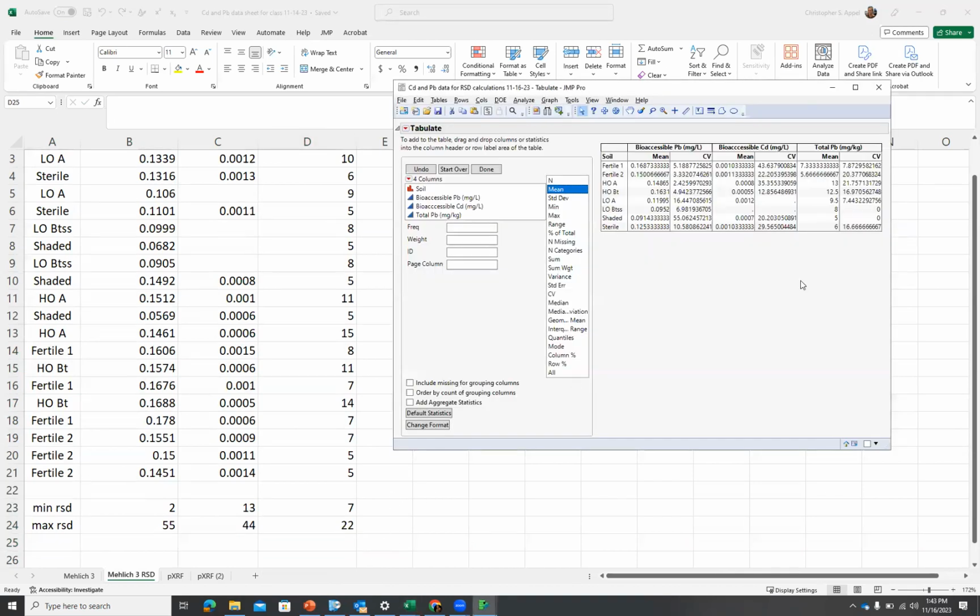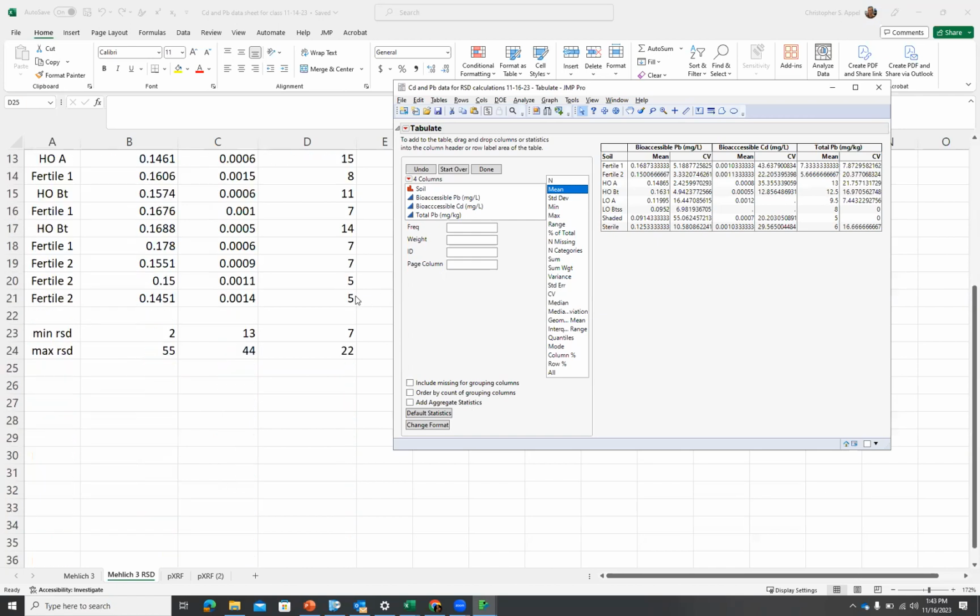I got some zeros in there. I do. Oh, you're right. Oh, wait. Yeah, I do have some zeros in there. So I'm trying to figure out though, is that in locations that I don't have data for? So those BTSS for total, I probably do, huh? Okay, so you're right. I'm sorry.